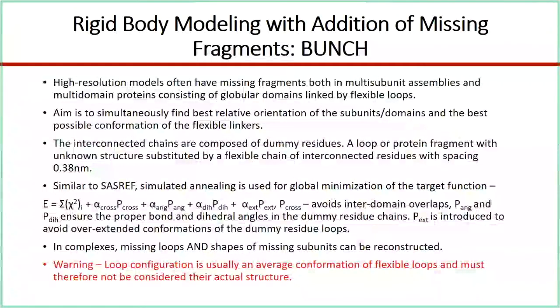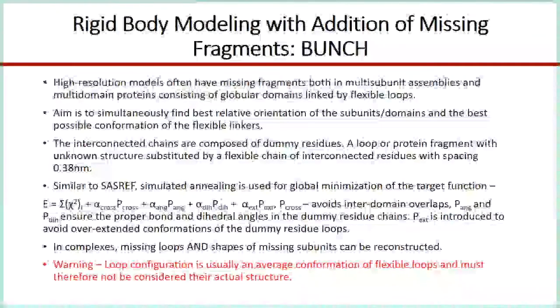That happens iteratively, and then simulated annealing happens to refine that. That's how the complexes are built in the case of CORAL. I'm sorry I didn't put a slide for that, but it essentially combines the features of both SASREF and BUNCH, along with this library for random coils.